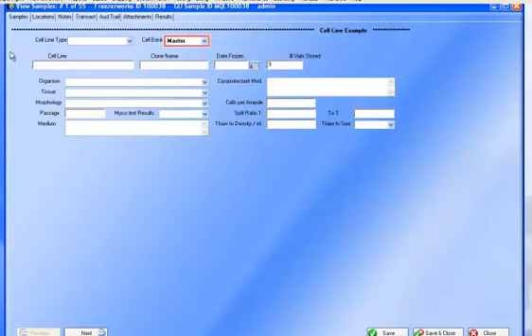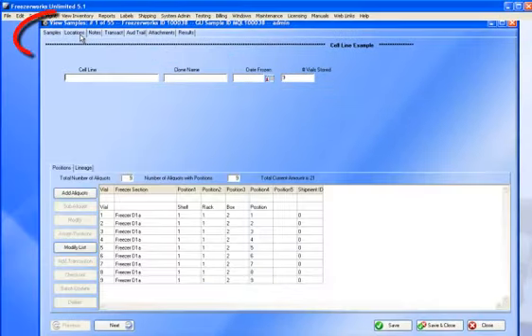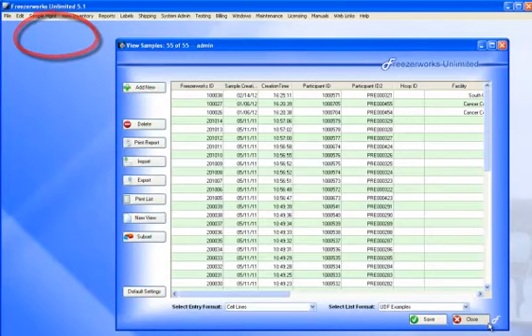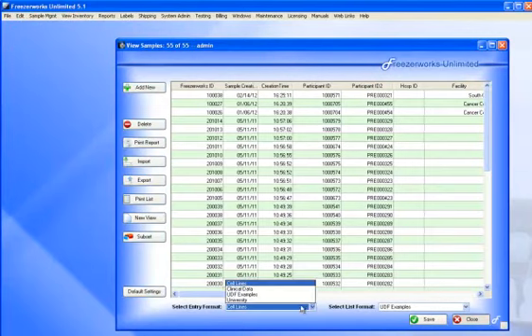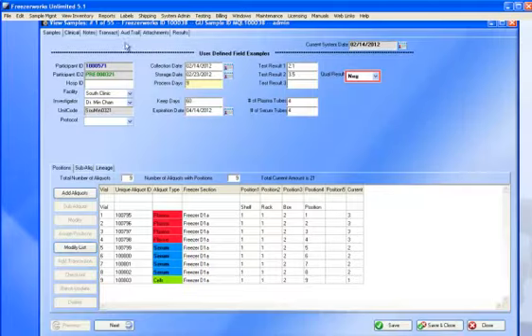On this screen, the locations are on a separate tab, and that's another example of perhaps a cell bank of cell lines. Here's one of clinical data, and the first screen looks a lot like the first screen we had before.